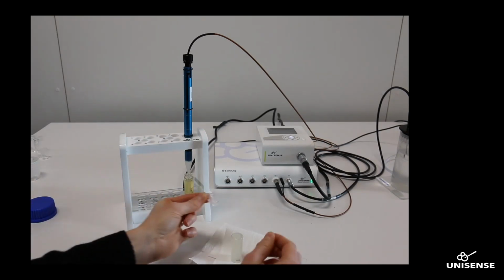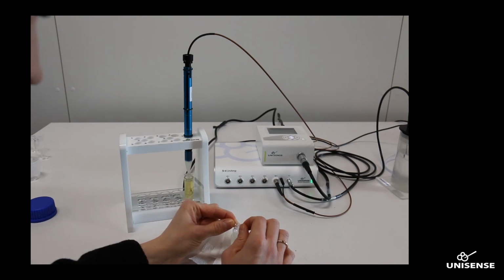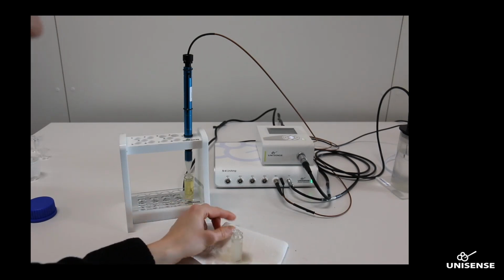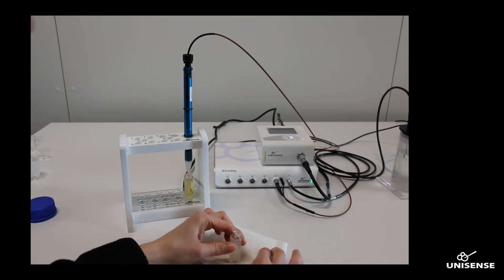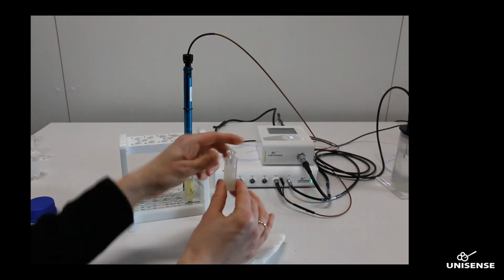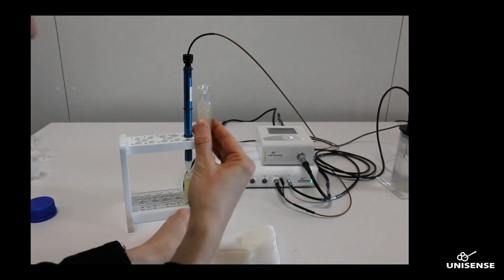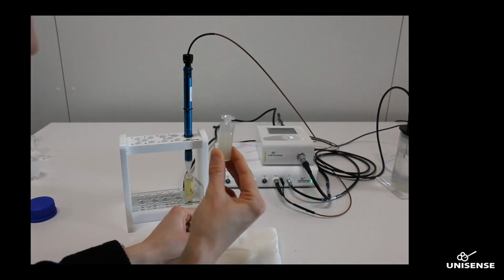And then you add the lid, and it will spill over, but this makes sure that you have liquid all the way up through the capillary hole in the chamber. So it has to spill over a bit. Always have a look at your sample and check that you have no bubbles inside of your sample. You don't want to have an air phase in your sample.